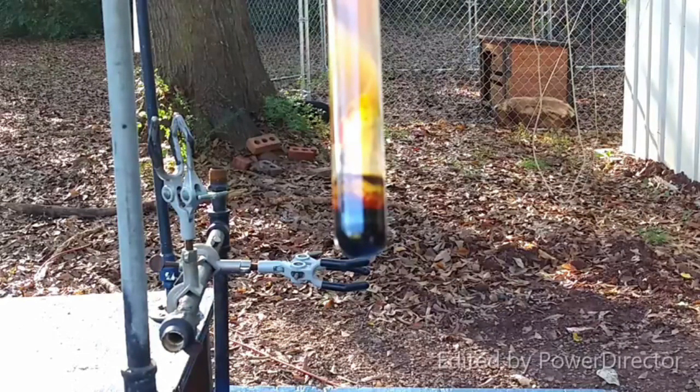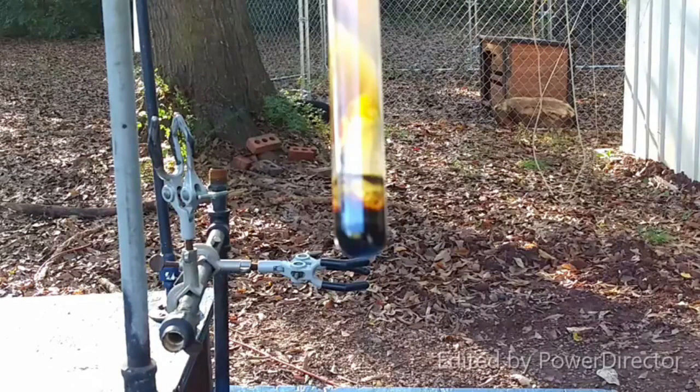Indium monoiodide is supposed to be a red solid — it's supposed to be a red liquid too. It's hard to tell; it's just so dark it looks black.